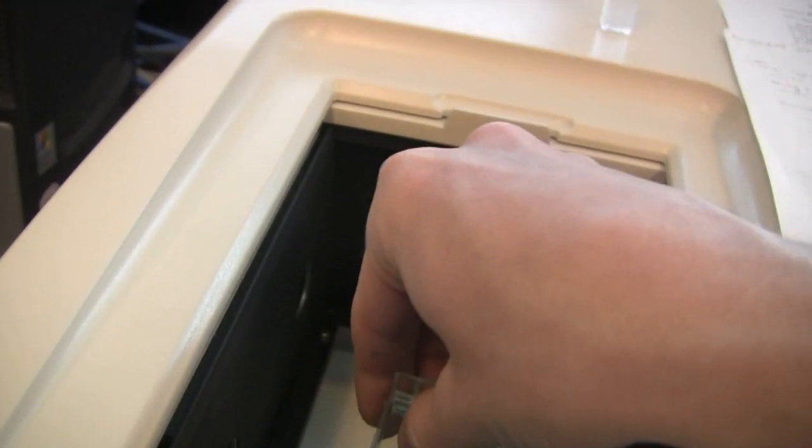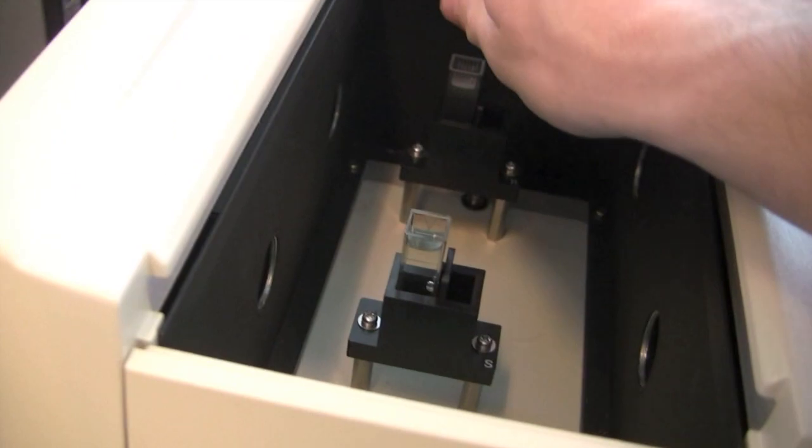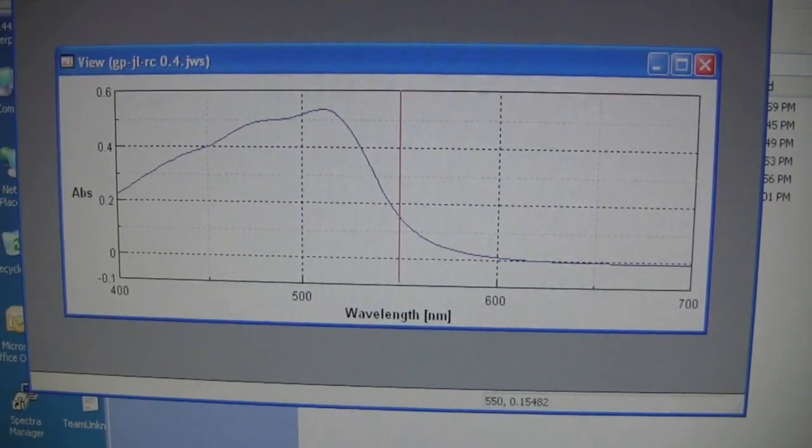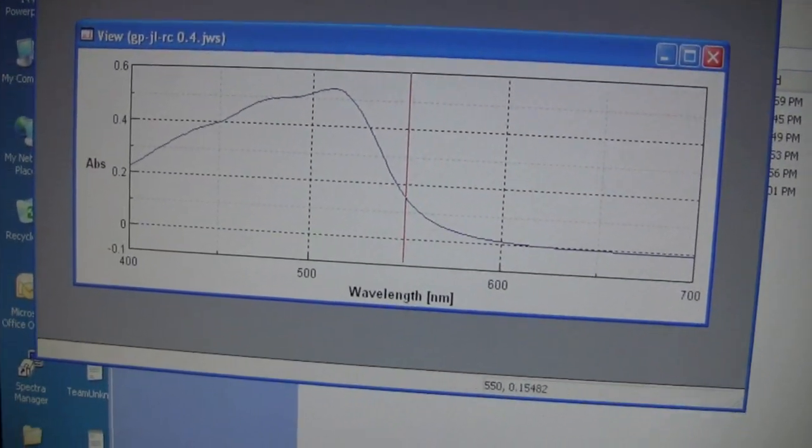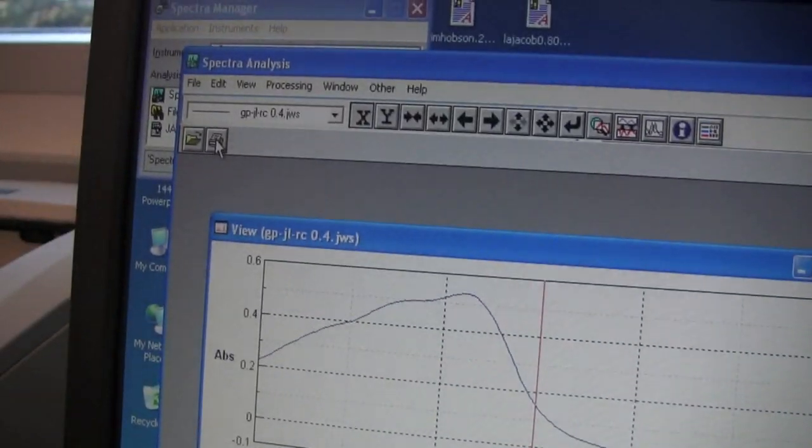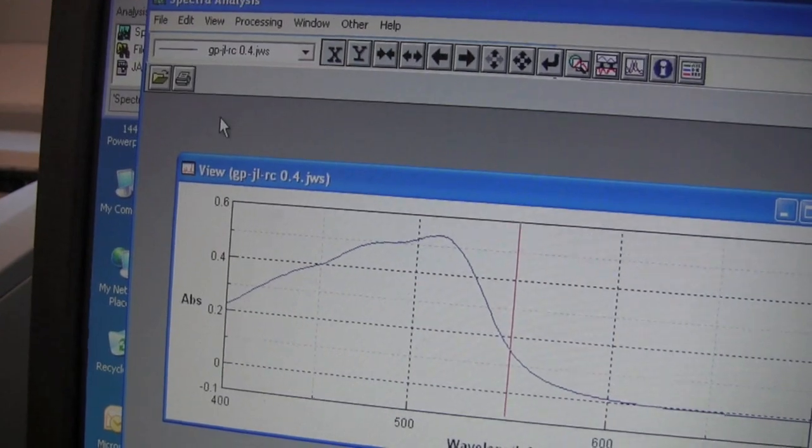Take the unknown concentration solution and follow all the same procedures as you did with the others. You should get a separate graph for this unknown concentrated solution. Also, print two copies of this for you and your partner.